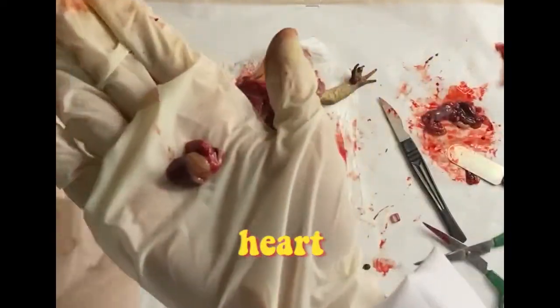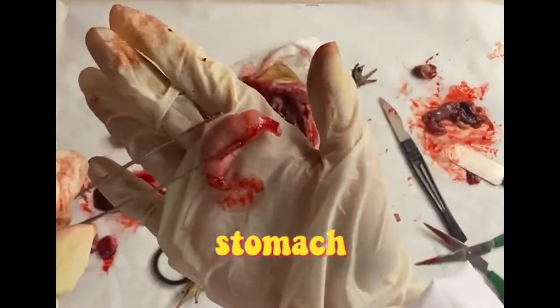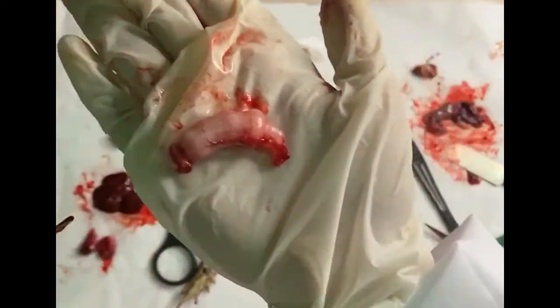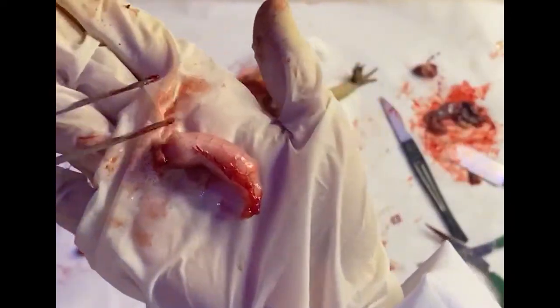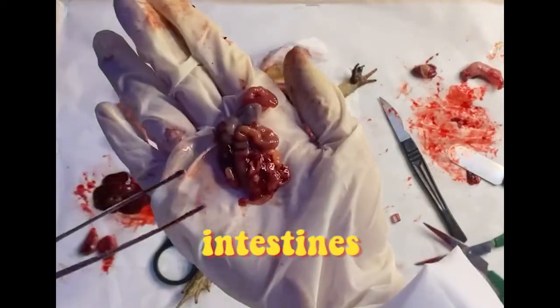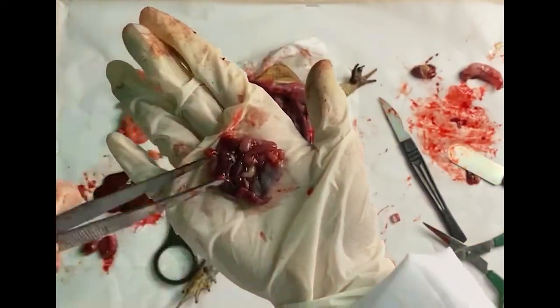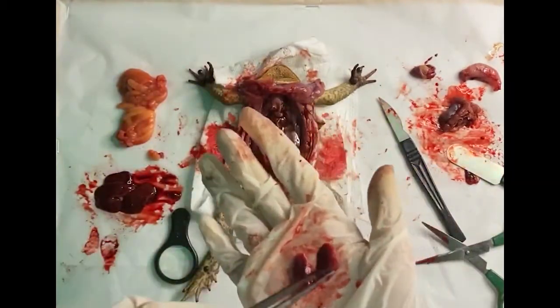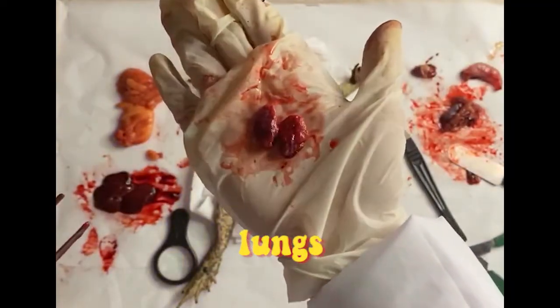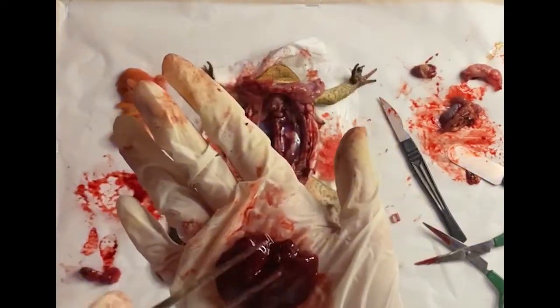Here is the frog's heart — it's still slowly beating. This is the stomach; it began excreting some fluids when I placed it on my hand. Here are the intestines, small and large. These are the lungs — they're quite small since they're deflated. And finally, the liver.